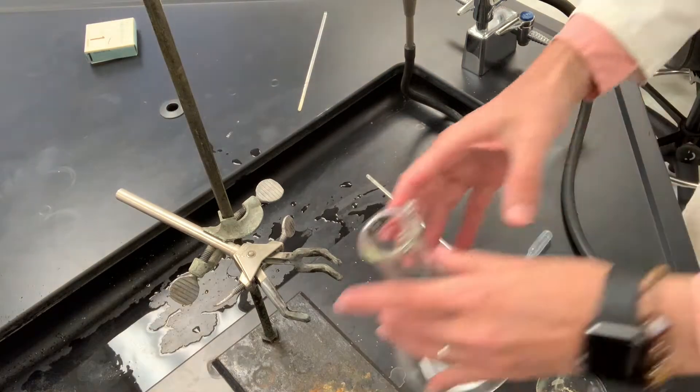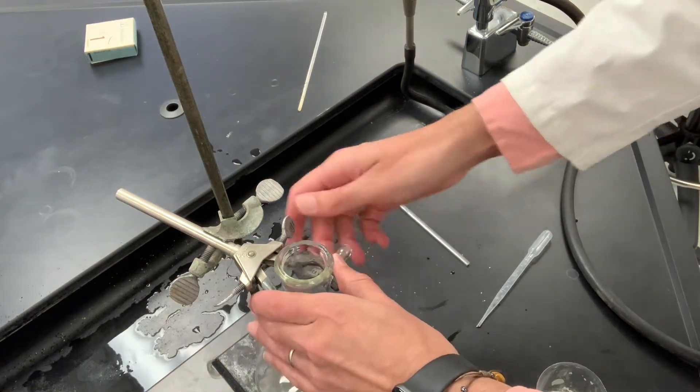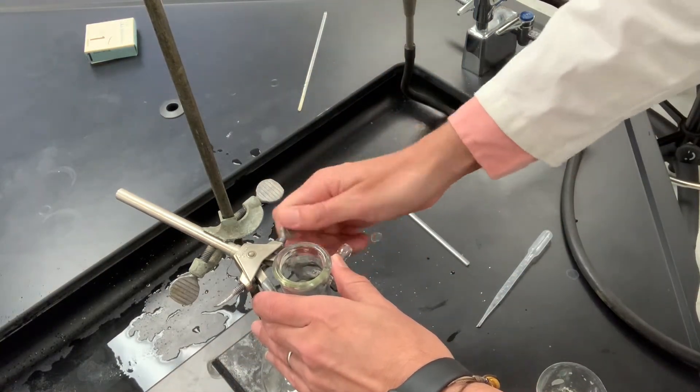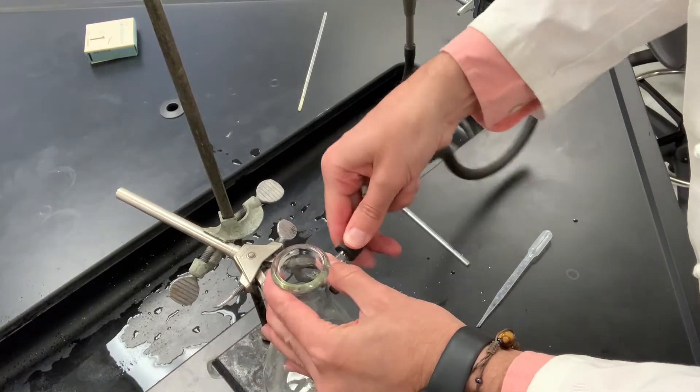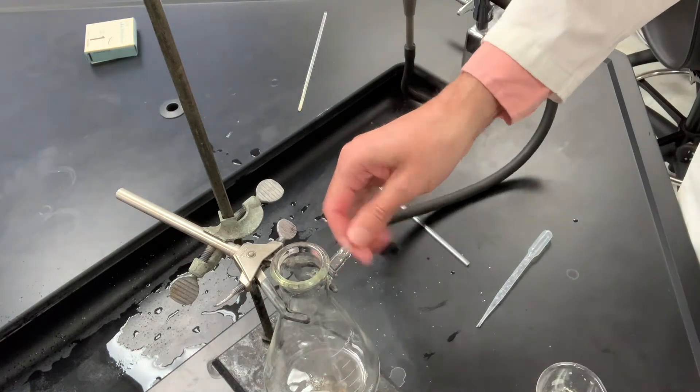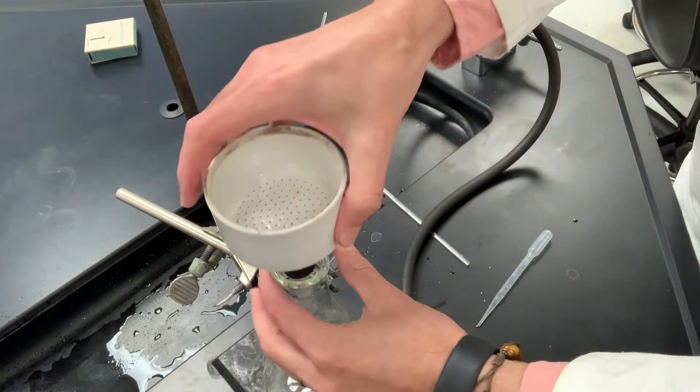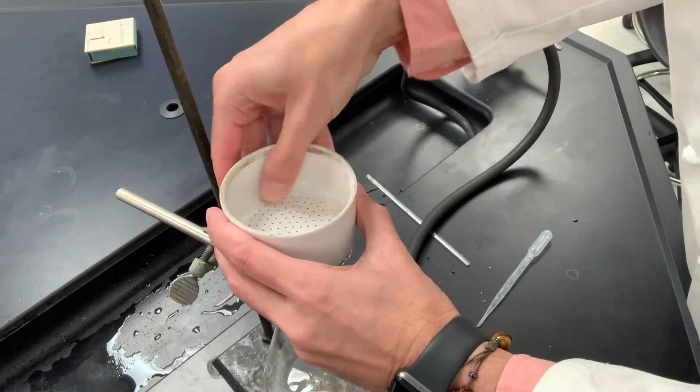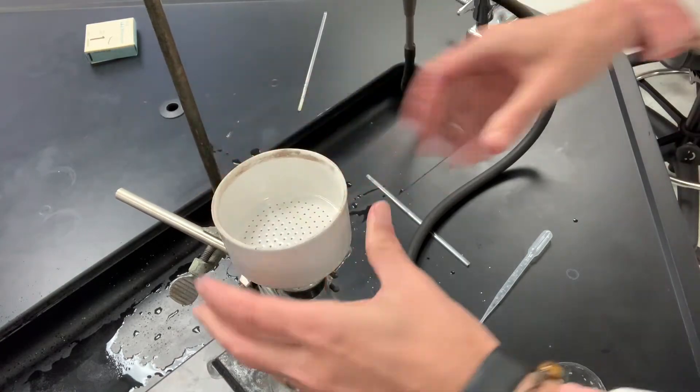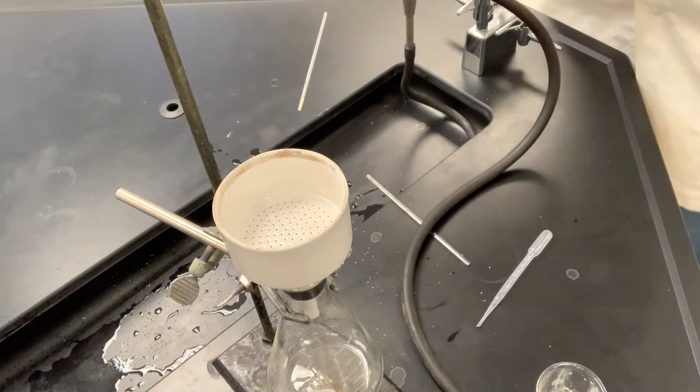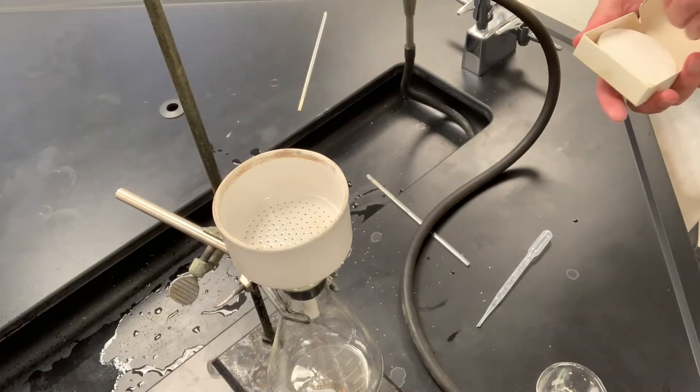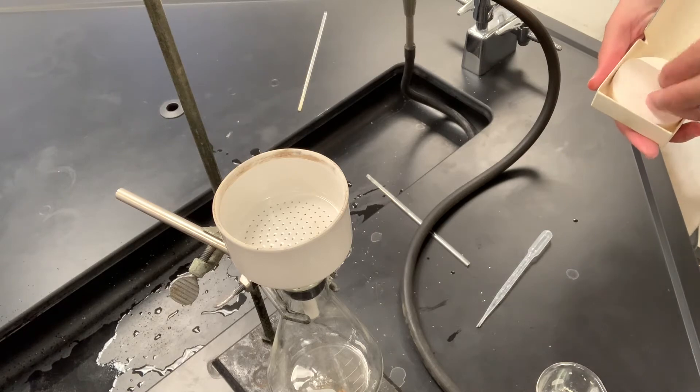Now we'll go ahead and filter the copper nitrate catalyzed oxidation of benzoin, and we'll just do exactly what we did before using a different Buchner funnel. We'll wet some filter paper here.